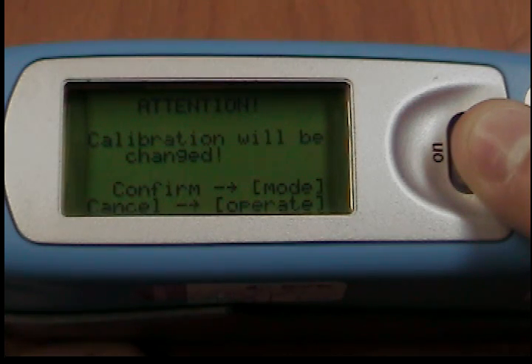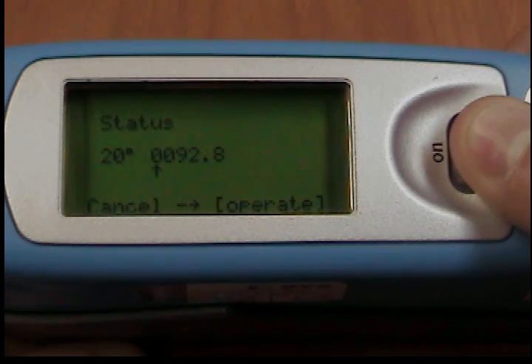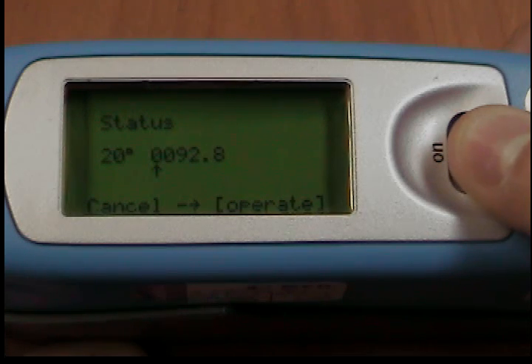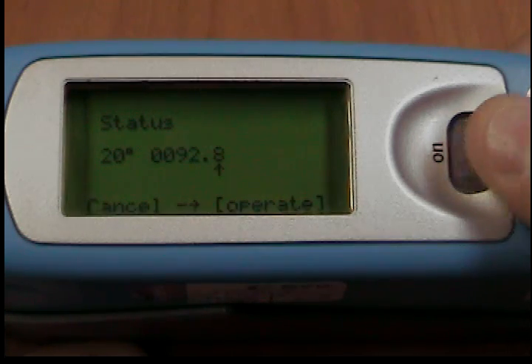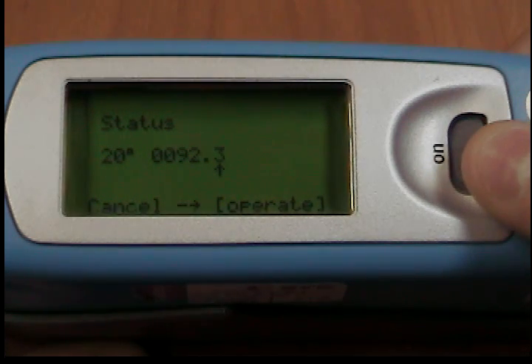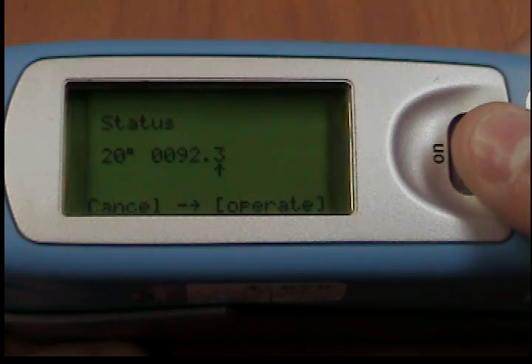In the next display, you can enter new calibration values. After you have entered the new value, a warning message appears again in the display. You can abort the process with Operate. If you confirm the new value by pressing the scroll wheel, the value will be accepted. After you have changed all necessary values, you should recalibrate the measurement device as usual.